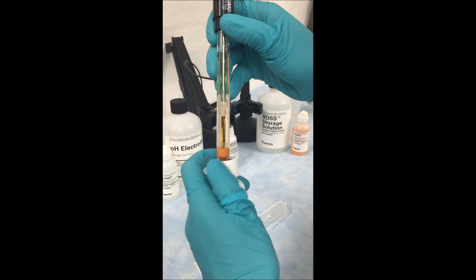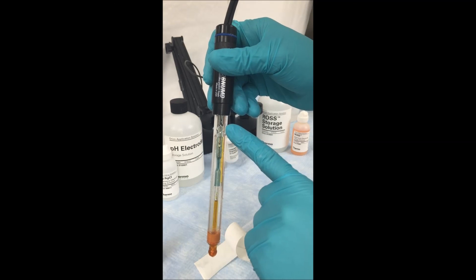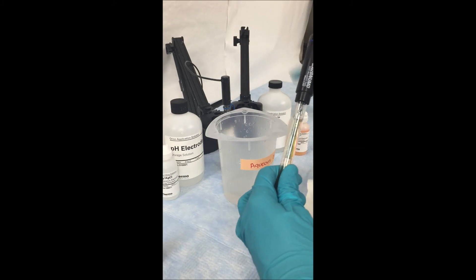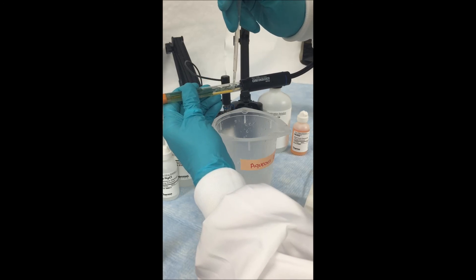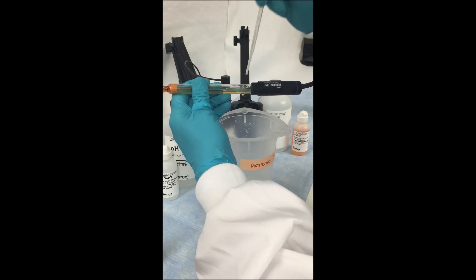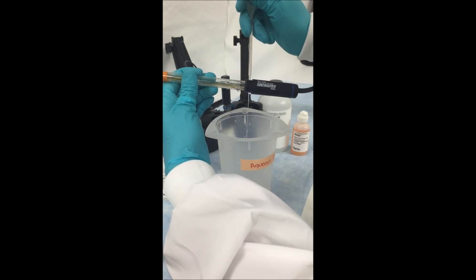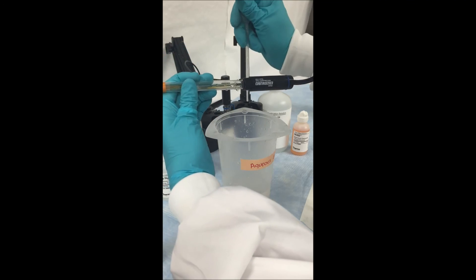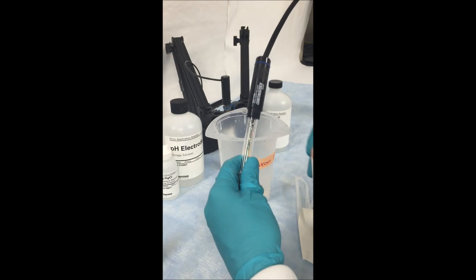First, remove the electrode from the storage bottle. Then locate the fill hole on the side of the electrode. Using a waste beaker and a disposable pipette, remove the inner fill solution by gently sticking the tip of the pipette into the fill hole and inverting the electrode so you can easily access the fill solution. Remove the fill solution until there is none left. When you get to the end, it may be hard to get the rest out, so you can shake the electrode to try to get out the last remaining drops.